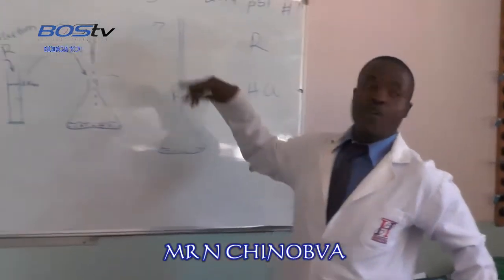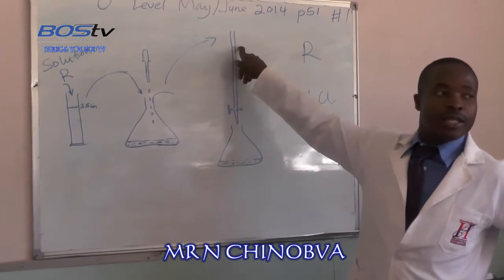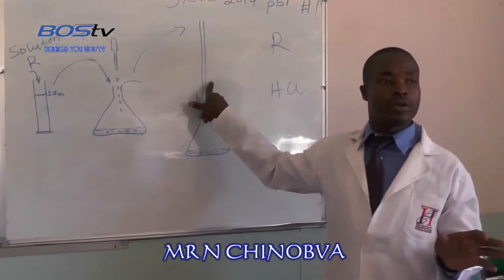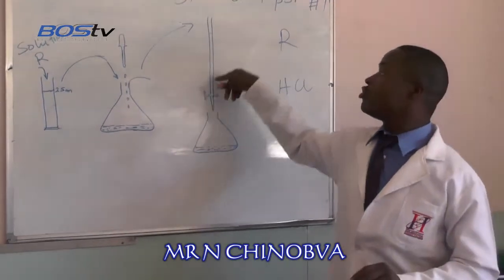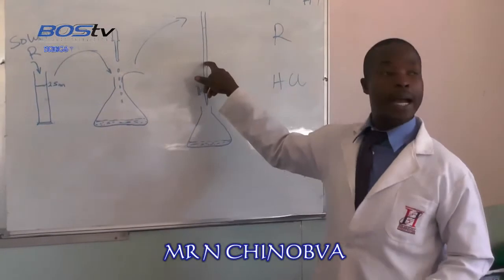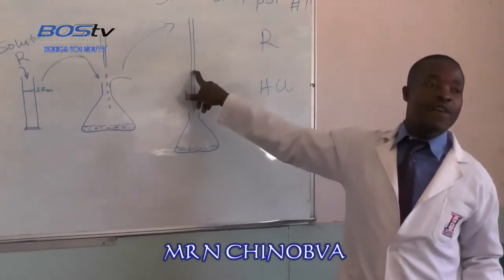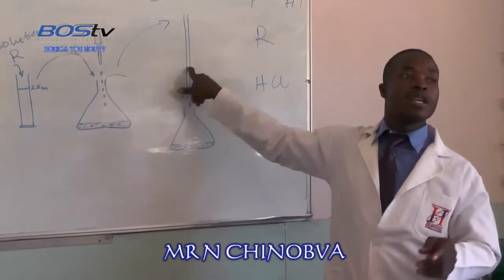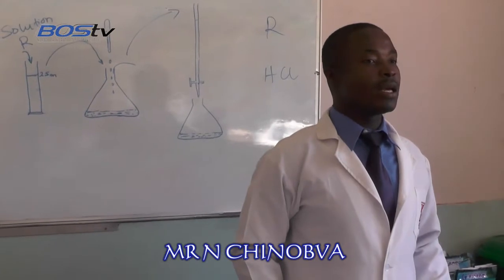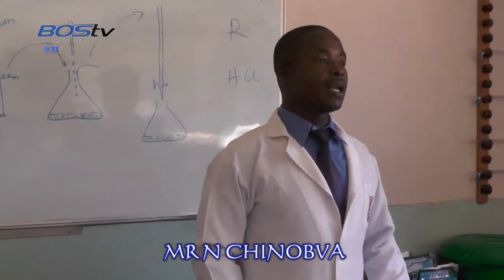From that, you continue the titration. Your first volume is noted from your initial burette reading to the final, where you obtain a colorless solution. After that, you continue and don't add more acid to your burette. Continue from that same mark, so your initial burette reading will be the value of the last endpoint. Then continue the titration until you get a pink color again as your endpoint. Are we clear? Yes. Okay, let's do it.